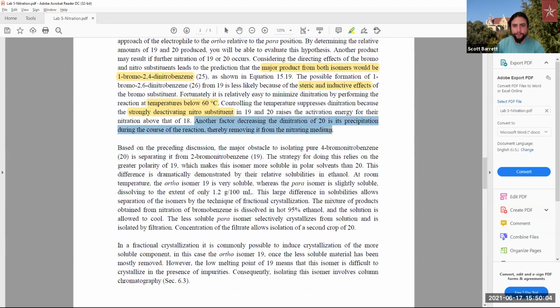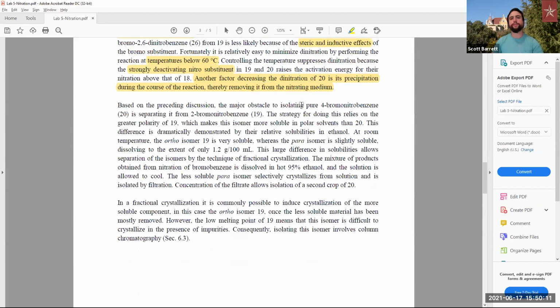And it can also precipitate out. And that's going to be part of the procedure that we're going to be tackling. For that way we can obtain our precipitate and stop the reaction in its steps.